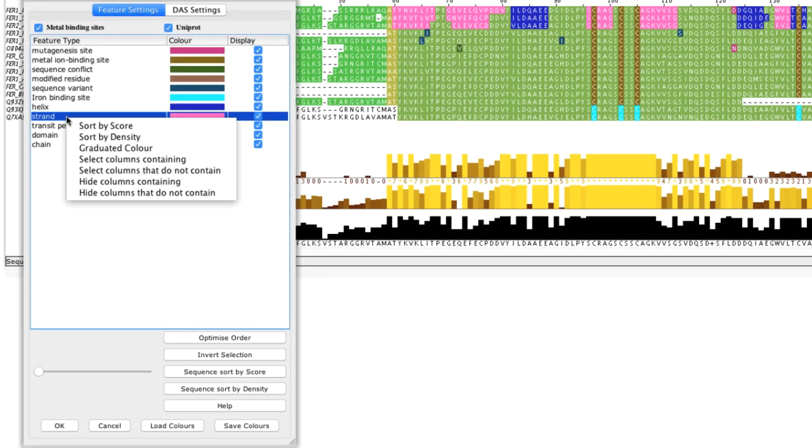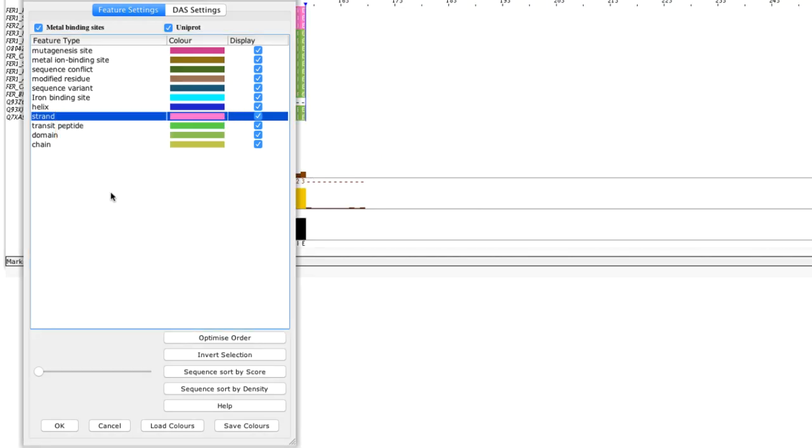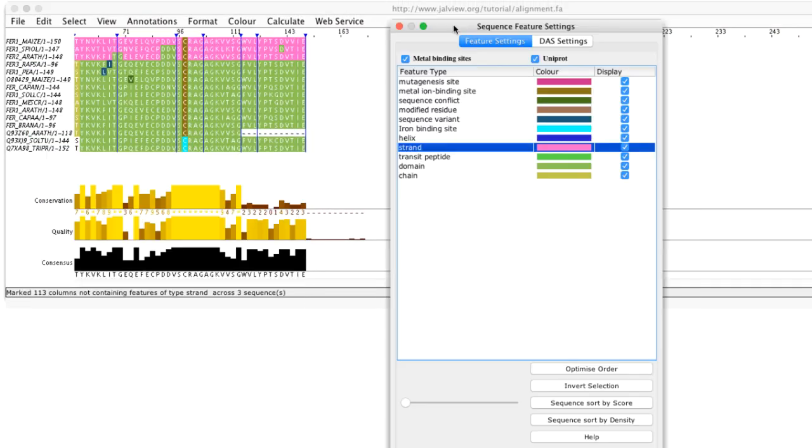Right clicking the mouse opens the sequence feature type menu. This context menu has several useful options. For example I can hide all the columns except those that have specific features.